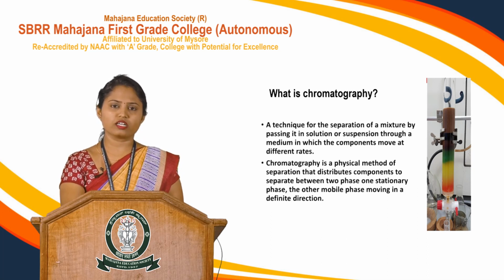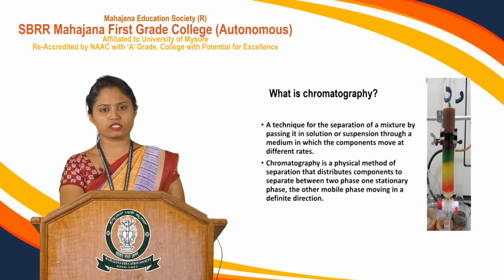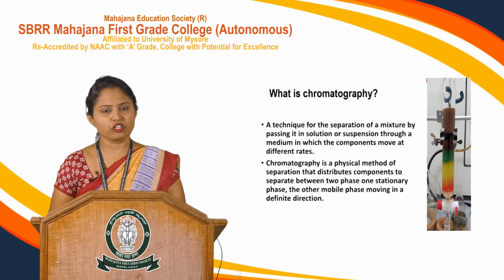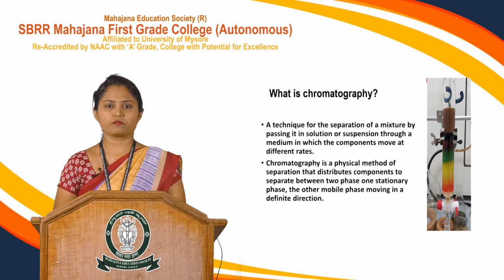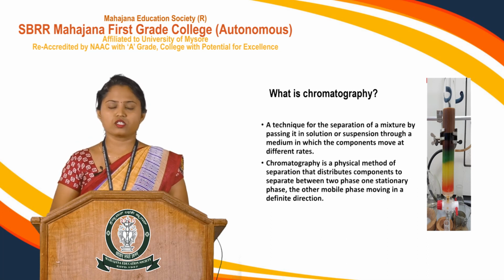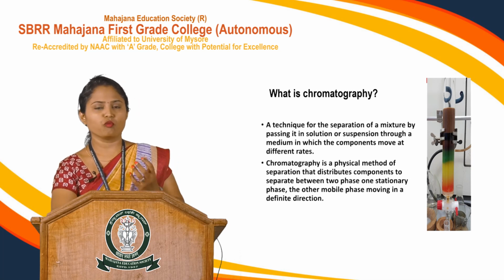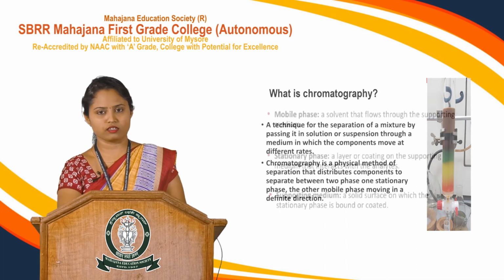It depends on the type or nature of the mobile phases as well as the stationary phases. For this chromatographic technique, to begin with, we need to know two important terminologies: what is the stationary phase and what is the mobile phase. Stationary, the name itself indicates, means completely fixed. The stationary phase is a supporting medium, the place where a molecule or analyte is held on the surface.